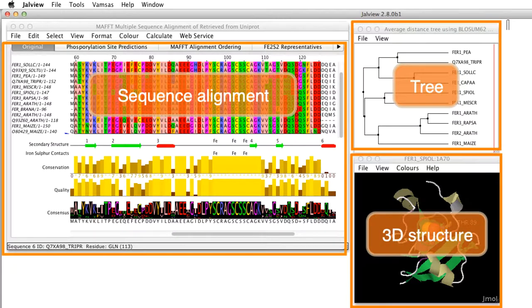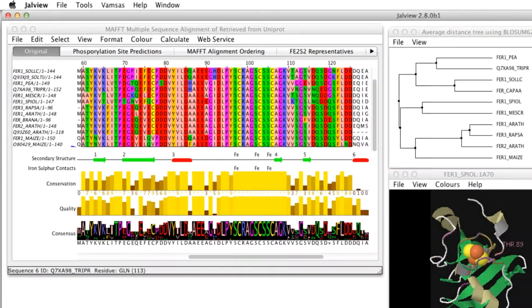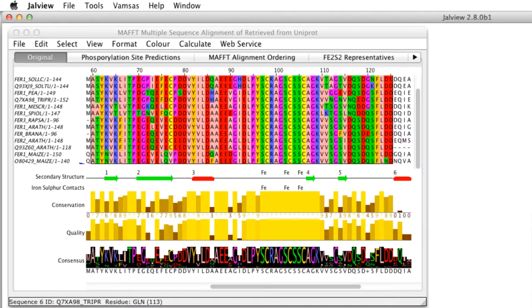All windows can be moved, resized and closed independently. The alignment window is the primary window for visualizing and editing.